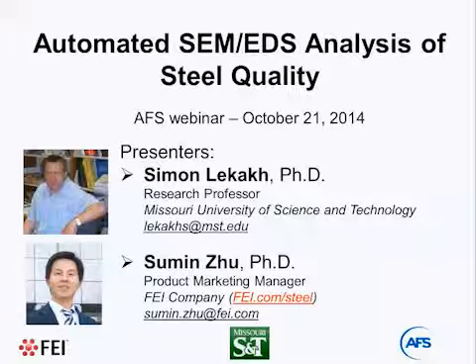It costs a lot of production and has a strong effect on casting properties. One of the main practical problems is how to evaluate steel cleanliness. Sometimes our simple observation of steel quality using metallography does not indicate any troubles. Nothing seems to have changed in our technology. However, suddenly we get a severe problem with casting quality.